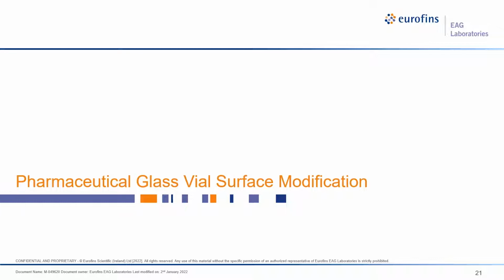It is generally accepted that extreme pH conditions react with the glass vial and the surface weakens, and as we saw in the hydration profiles, the sol-gel-like structure starts to form and eventually breaks off, and these flakes float into the drug solution. Obviously, this is not a desirable outcome. How does SIMS help with that?